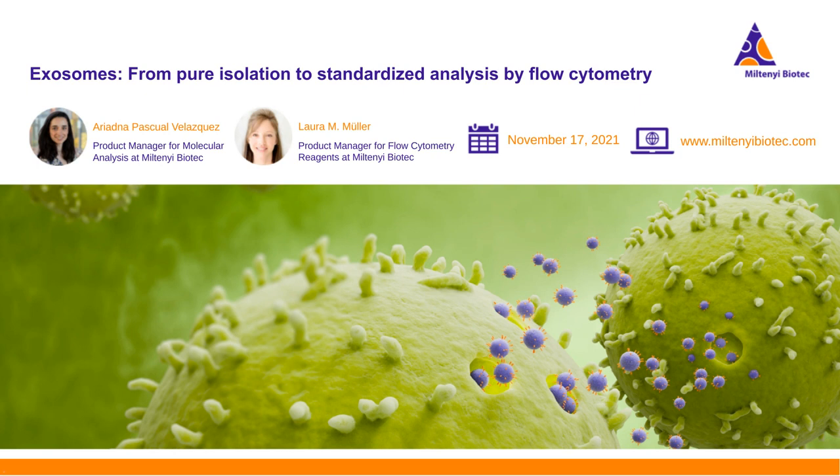That's, of course, on the one hand a positive effect, because you know that you really have a specific staining. For example, if you're using serum in your cell culture, there's always the risk that you get vesicles from the serum in your samples, and this might interfere with your analysis. We could show that, due to the specificity of the antibodies, we do not get any signals from these bovine EVs. So it's really specific. But on the other hand, if you are interested in different species, the assay will not work, unfortunately.